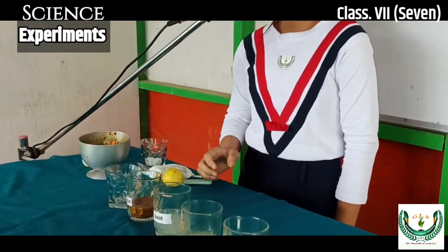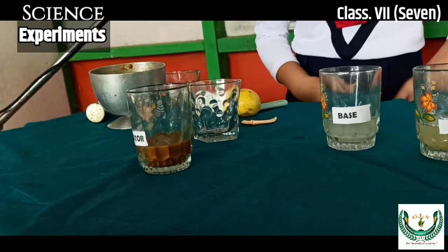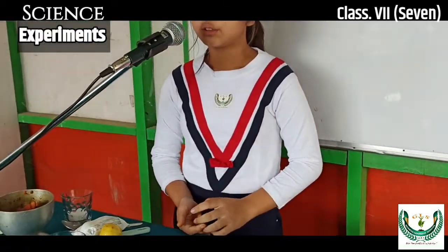Now our concentrated turmeric indicator is ready to be used as an indicator and identify whether the substance is acidic, basic, or neutral.